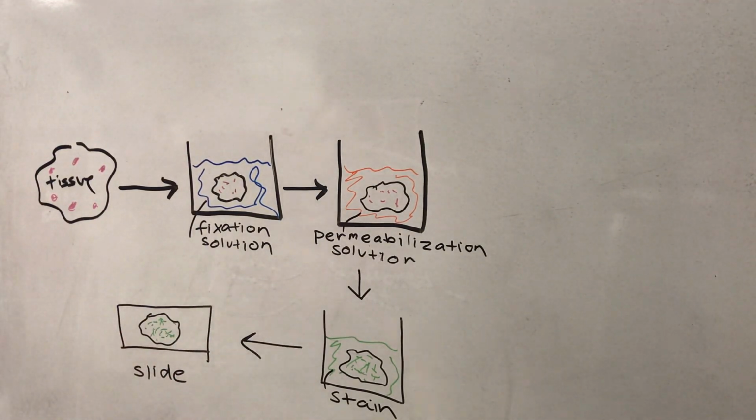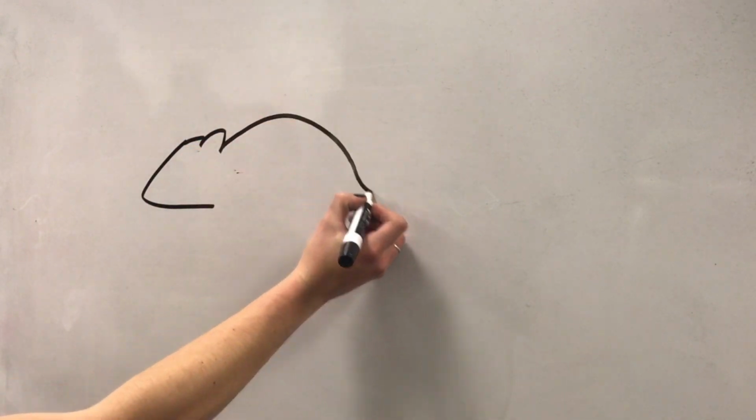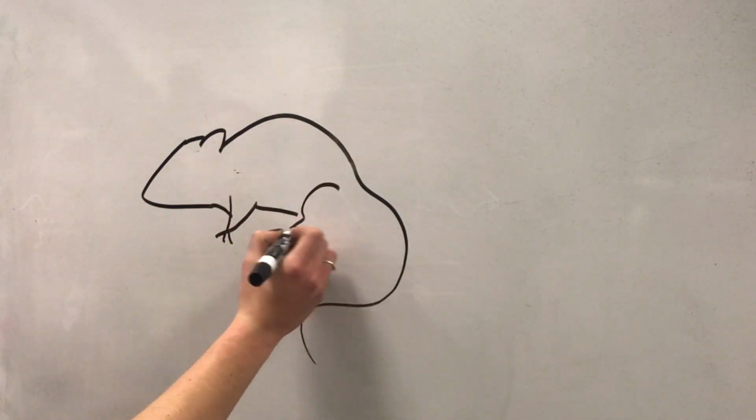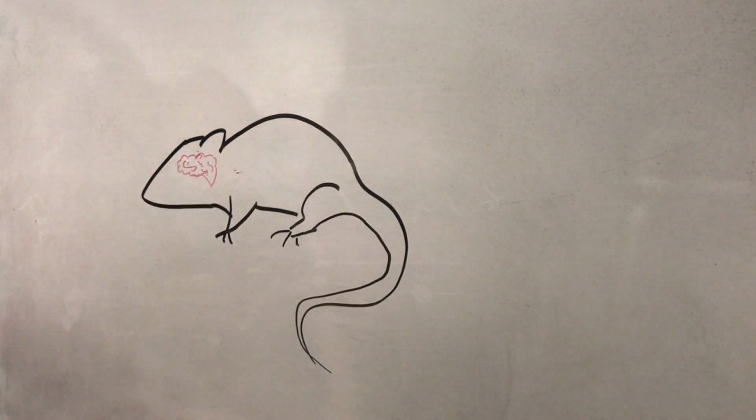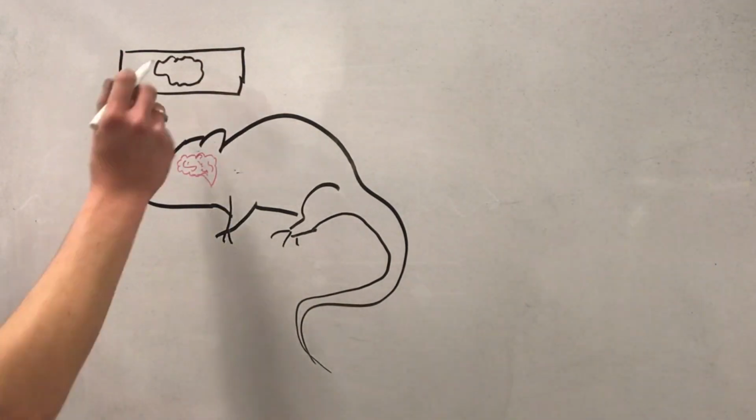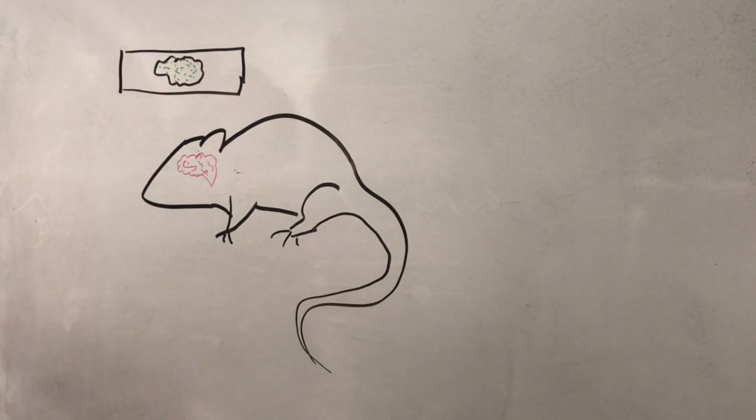TPM can be used to characterize cell structure of living sedated species, typically rats, or more commonly prepared cell specimens on slides. Under optimal conditions, TPM can image up to several hundred micrometers in depth, typically 6-fold deeper than confocal microscopy.